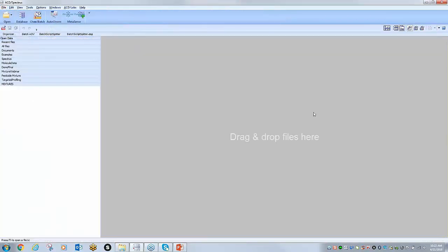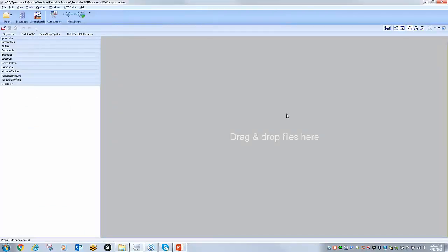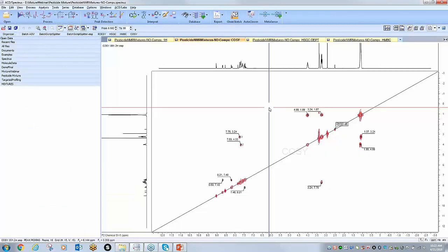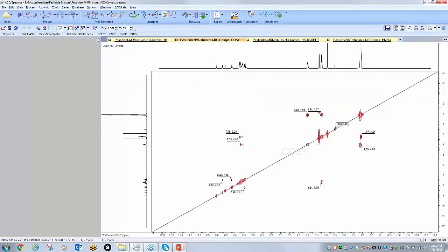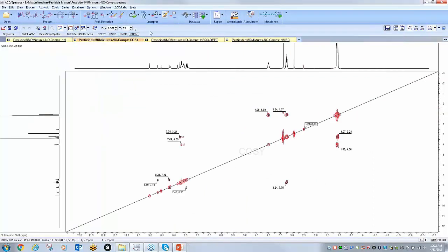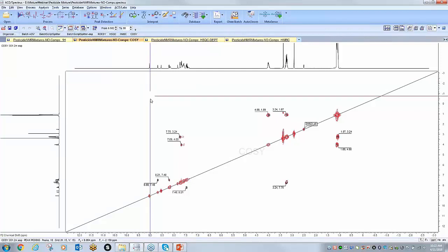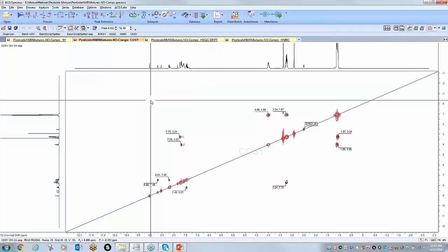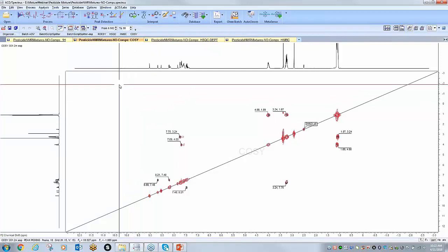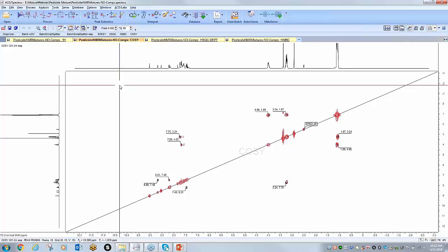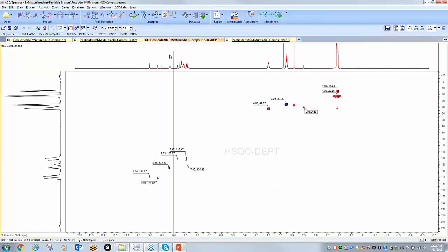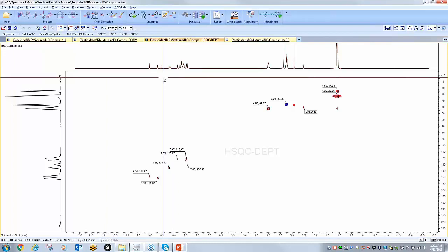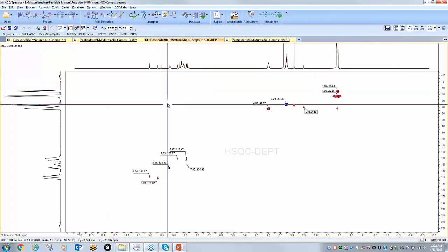You can work off of any spectra you wish, as this is from a project, and as I mentioned everything gets transferred to all the different spectra that are present. So I'm going to work off of the HSQC as I find this is usually the most logical place to start.